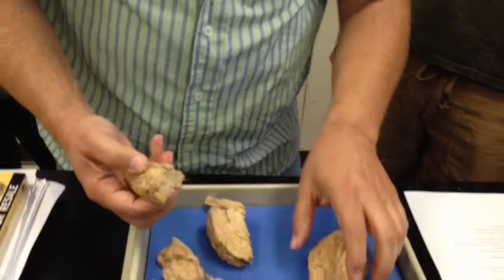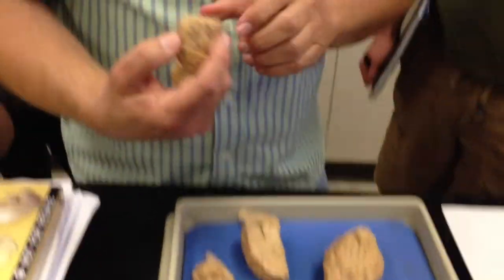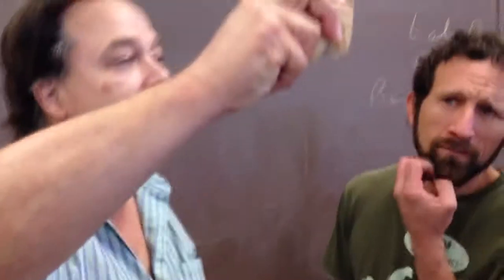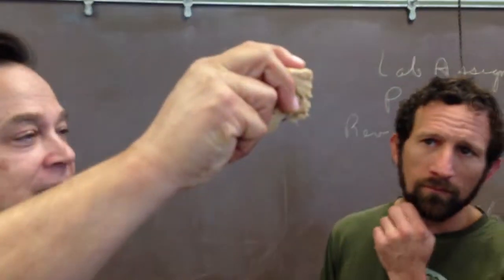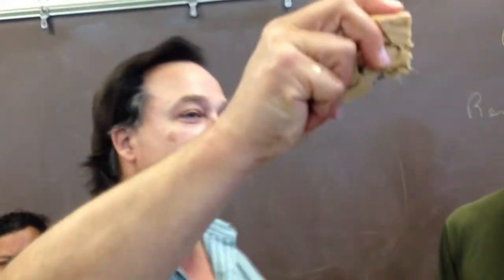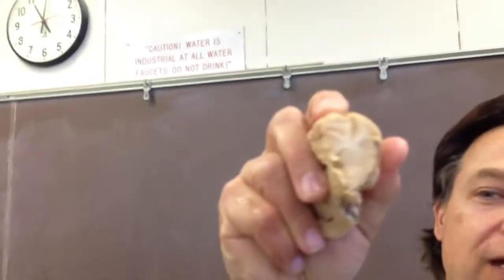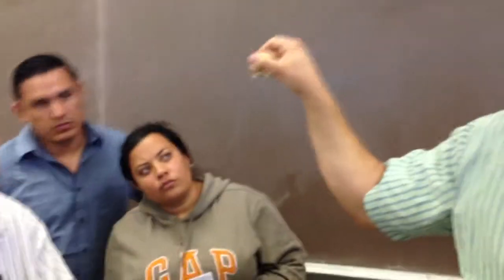The thing that you can see really well now is this business about there being a cortex and the white matter underneath it. You see it's grayish around the edges, and that follows the sulci and the gyri in and out, and then it's white inside. You're seeing the myelinated fibers. On the model, you're really looking at that outside, the cortex, but you can't tell. But on this, you can slice it open, and you can see that there's a discrete outer gray layer.